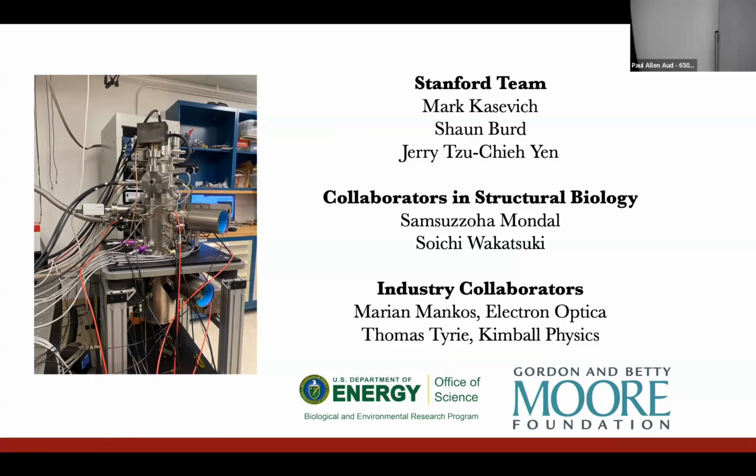Yeah, so this is a good question. Basically, the signal you should expect for SRS is linearly dependent on the pump power, right? And as we turn up the pump power, we get these linear increases in the Raman signal. And so the enhancement you get is independent of the pump power. And the comparisons we're doing are always normalized to the dose that you would apply for an equivalent single pass measurement.